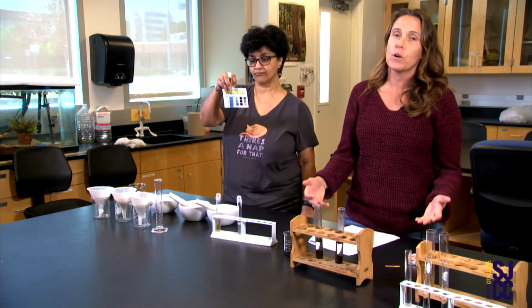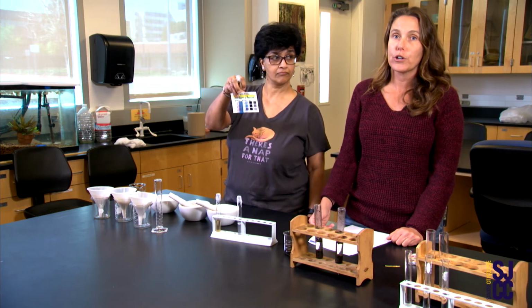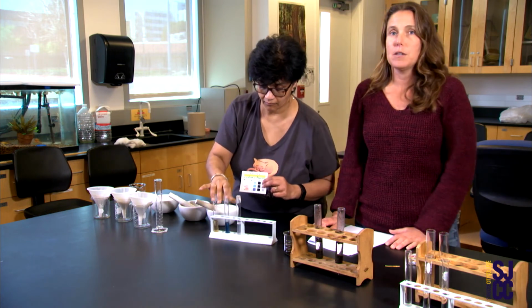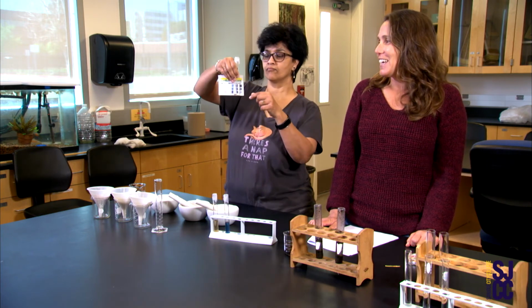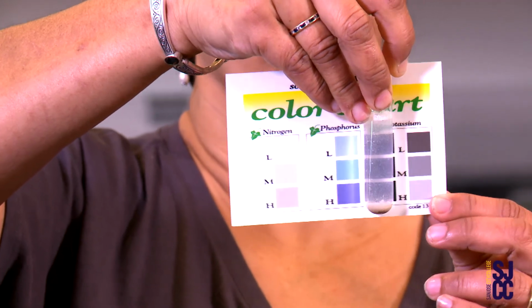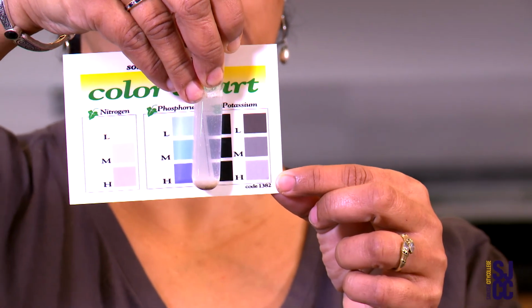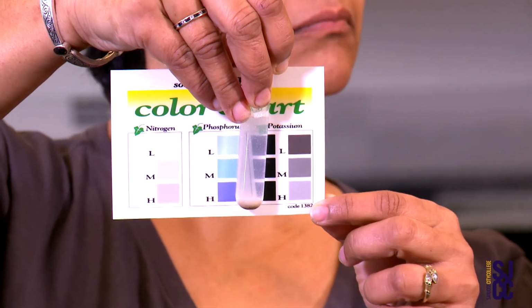And again, depending on what type of crop you're growing, you may have to decrease or increase your phosphorus content. The last test we did was the potassium, right? So potassium is our third macronutrient that we looked at. And this one is a little bit difficult to tell. I'd say on the high scale, right? We have it showing at the high scale because it's not as vibrant of a black-gray, but you can go either way. It's on the lighter shade of that coloring.